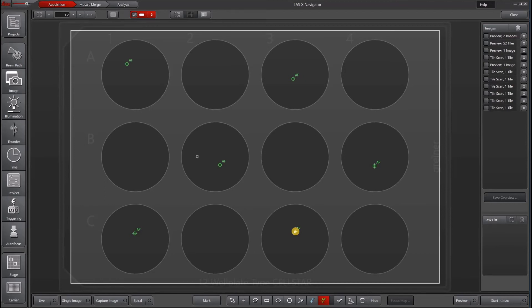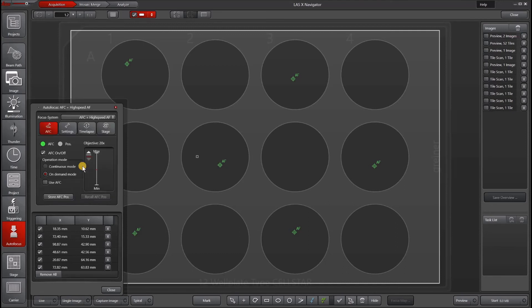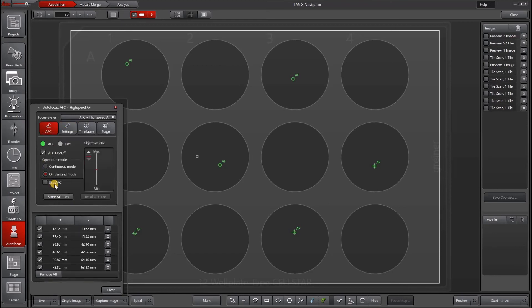You can also run autofocus with AFC adaptive focus control, which is the hardware autofocus feature that we have on certain DMI-8 microscopes. Under autofocus, you can go to AFC plus autofocus. This will give you the same settings and also lets you control the AFC. For instructions on how to use AFC, please see our AFC tutorial. Combining both AFC and autofocus is especially useful for long term time lapses, samples moving in and out of focus where you have to keep searching for the sample, and other challenging applications.